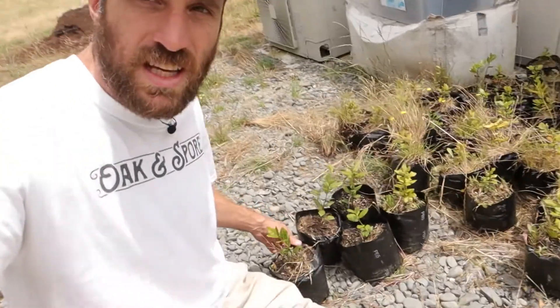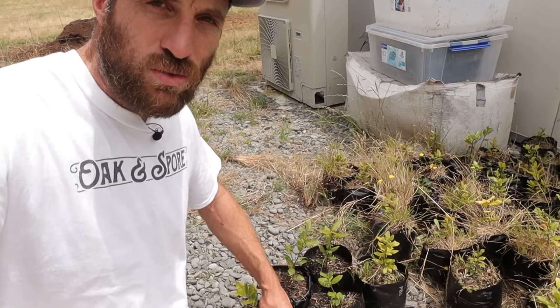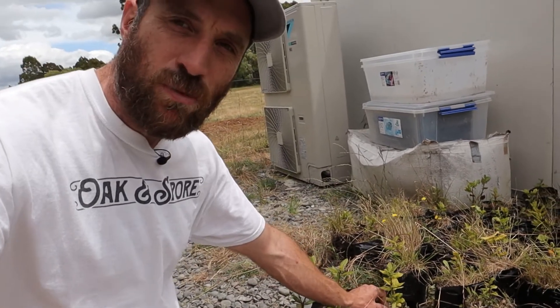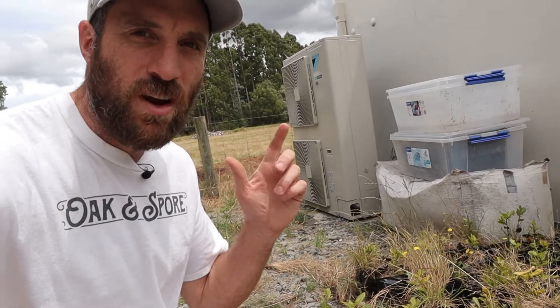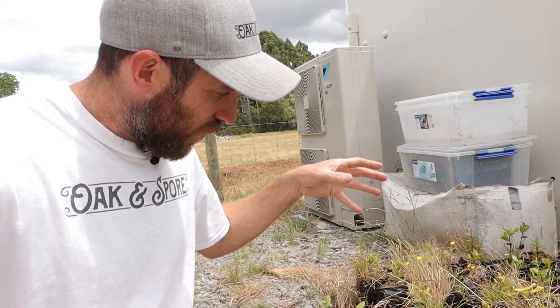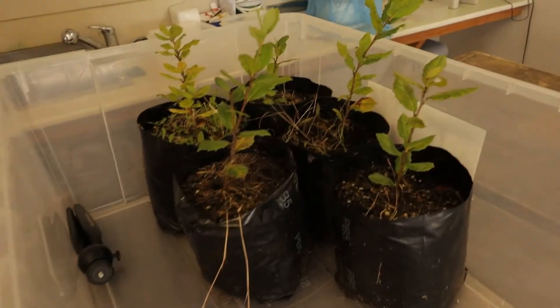I've got five sitting here which we're going to sample. We're going to take these to Alexis, who runs Mycotree Supply in New Zealand, and he is going to put the roots under a microscope so we will definitively know if my attempts at inoculating these oak seedlings were successful.